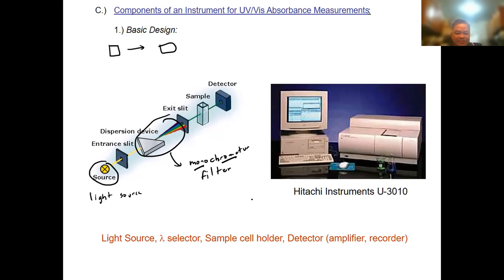And then you have the sample. And then you have what we call the detector. Now, sometimes here you can also have another cuvette, where you put your reference. Right? That is called double beam, versus single beam. Is our double beam spectrometer still alive? Yes sir, it's still alive. Still used? Only for demos, sir. A single beam is always a Spectronic 20; the other is double beam.